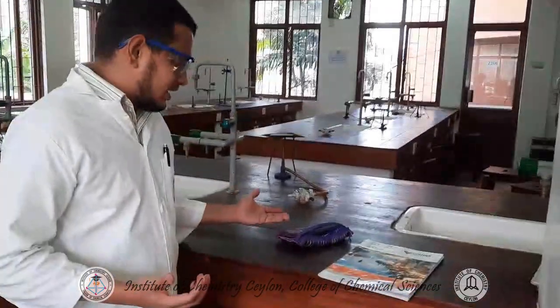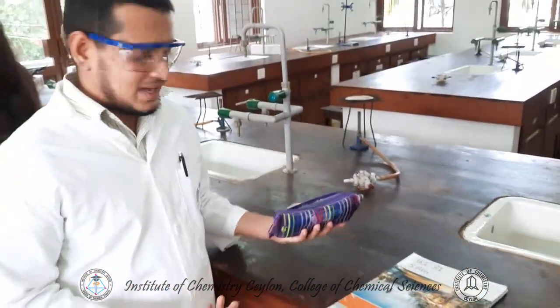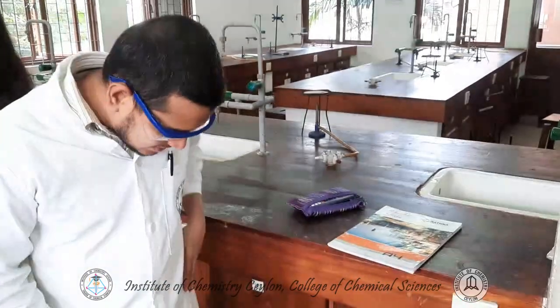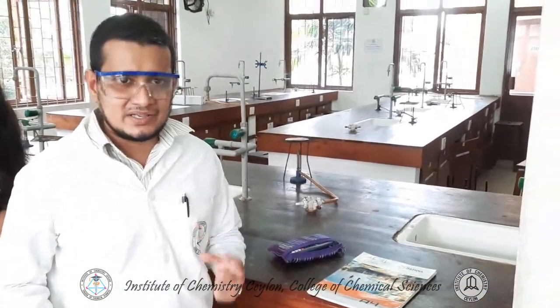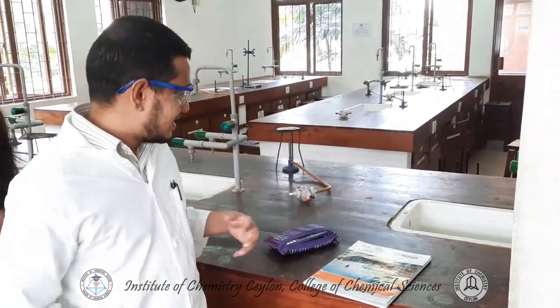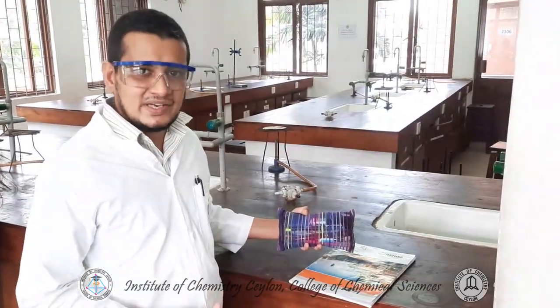And the next mistake she did was taking the entire pencil case inside the lab. You have 3 pockets in your lab coat. You need a pen, maybe a pencil, a ruler, and you can take all the necessary items, and as much as possible prevent taking unnecessary stuff inside the lab.